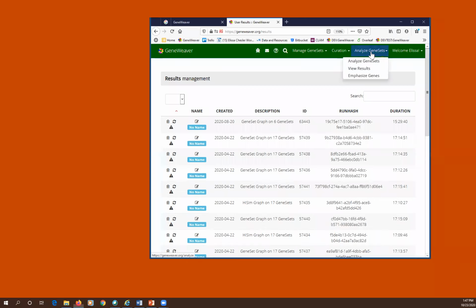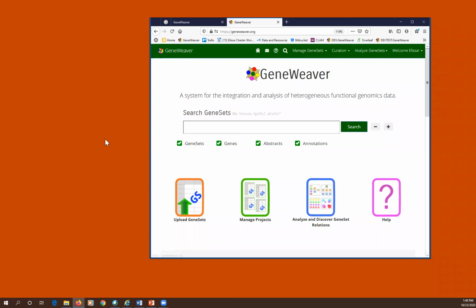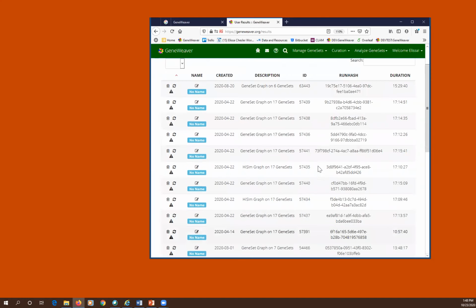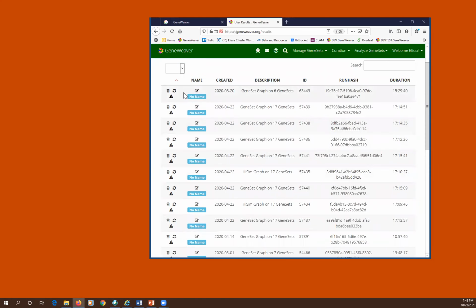All right. So you should be looking now at GeneWeaver. And if I go back to the home page just so you can easily see what I did. I went to the Analyze Gene Sets pull down menu, and you could see my results. These are the results of analyses that I've run. And because it's been more than a few days since I've run it, I'll have to re-execute this.